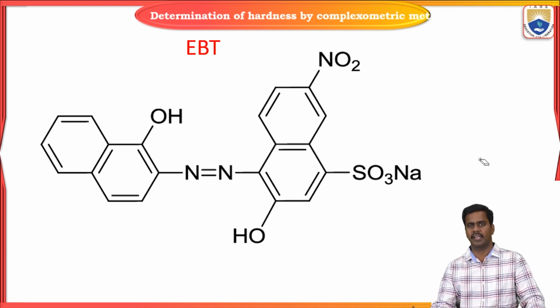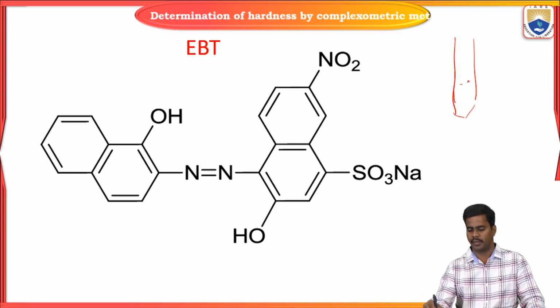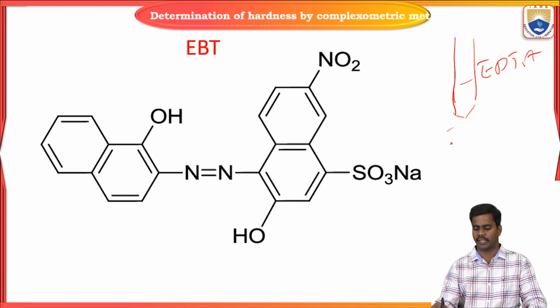So here, EDTA I'm going to take in a burette, and it is standardized by some primary standards like magnesium sulfate solution, etc. So I'm going to take some magnesium sulfate solution in a conical flask.